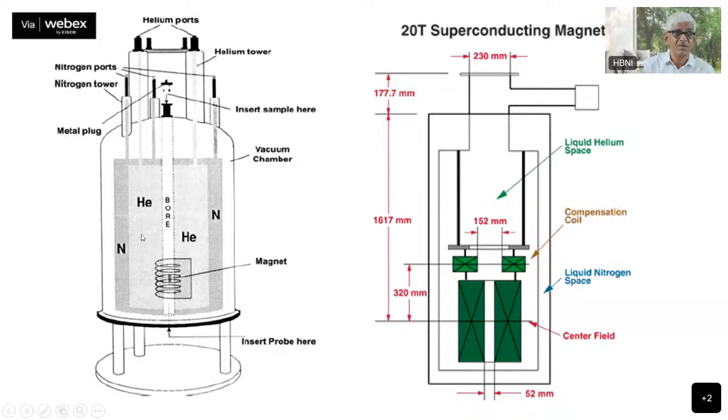So you have this liquid helium tank here. And notice here, you have a bore which remains at room temperature. You have coaxial cylinders here, and this is the top of the magnet. The top of the magnet remains at room temperature. Your sample comes to room temperature, and you can adjust the temperature as you want, but it is surrounded by these coaxial tanks, and the inner tank contains helium, and your superconducting wire is contained in this helium tank, and this probe, your sample, goes and sits in the middle of this.